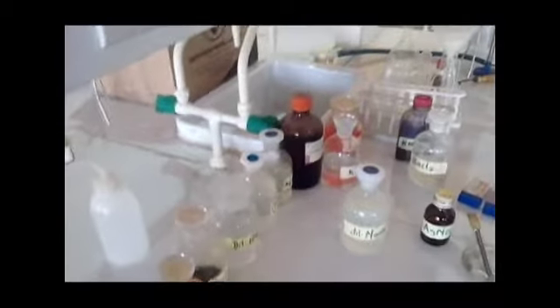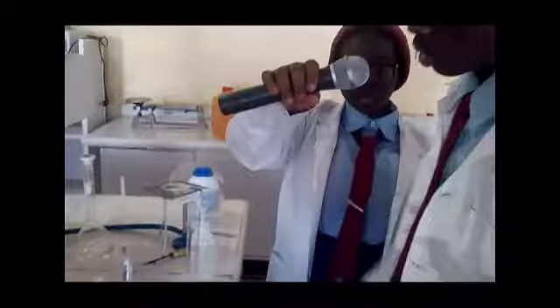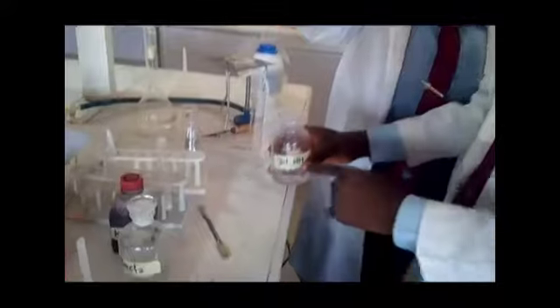Like I earlier said, the cations present in our samples, so also the anions, can be determined using reagents. Now these reagents react to give us characteristic reactions, and some of the characteristic reactions are the evolution of gas, the evolution or absorption of heat, formation of precipitate, production or disappearance of color. Now I'll carry out some experiments to demonstrate this. Now this is a reagent, dilute hydrochloric acid.